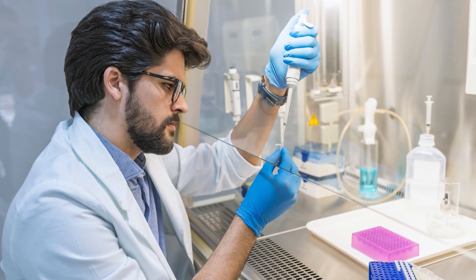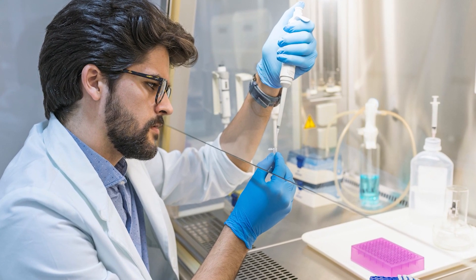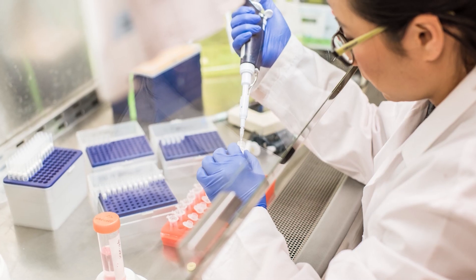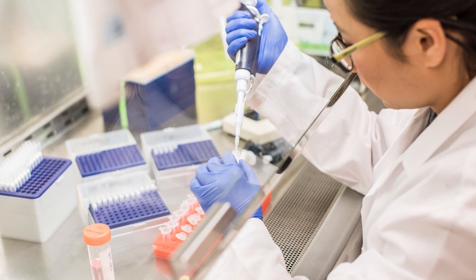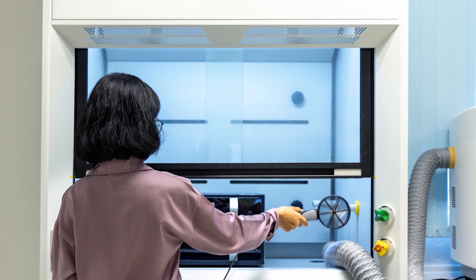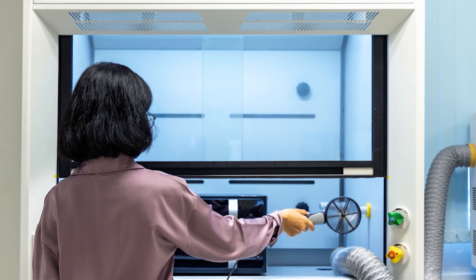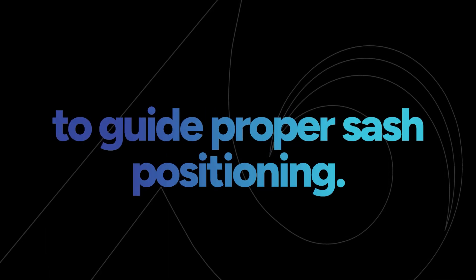A sash that's set too high can compromise containment by allowing hazardous materials to escape, increasing the risk of exposure. On the other hand, setting the sash too low could restrict airflow, reducing the fume hood's effectiveness and potentially leading to inadequate protection. That's why operators should be trained to adjust the sash to the recommended height for the specific tasks being performed, and signage should be clearly displayed to guide proper sash positioning.